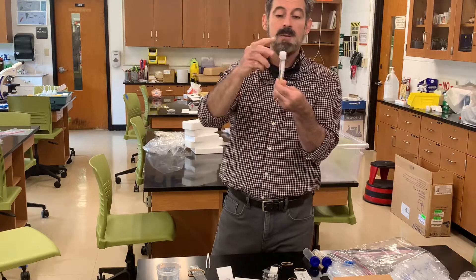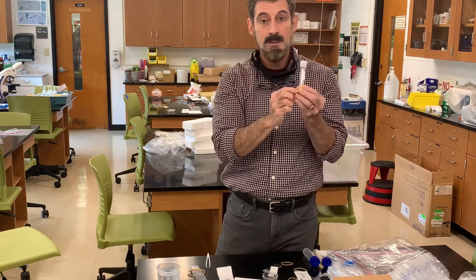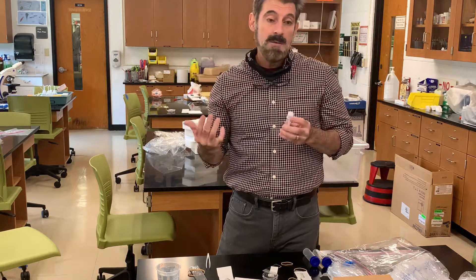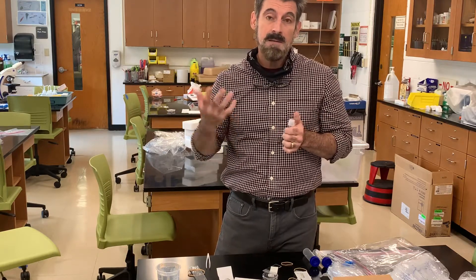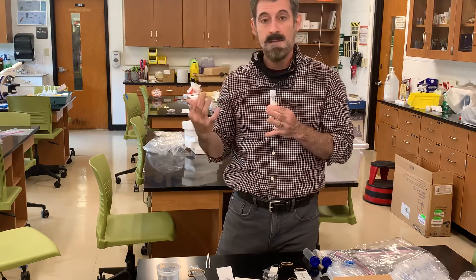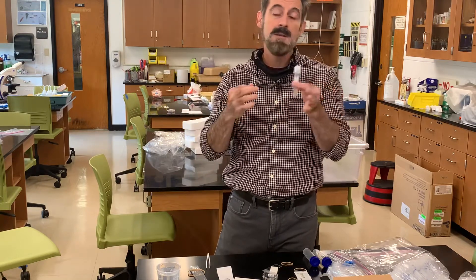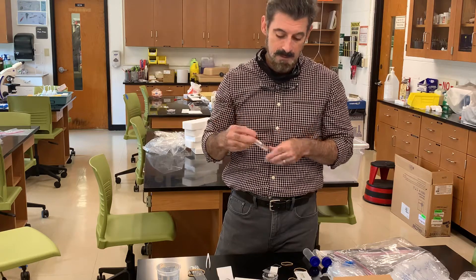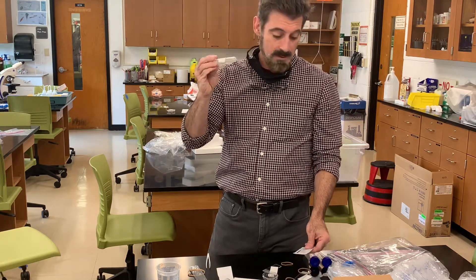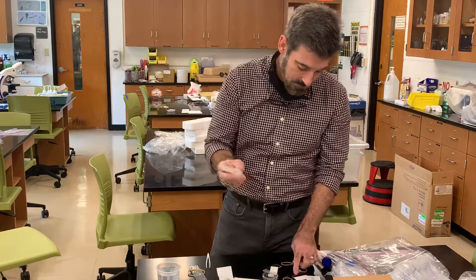In another small tube you're going to have pH strips. There will be a pH lab where you collect different liquids from around your house — anything from juice to water and other things — and measure their pH. There will be a reference to a pH scale, and you'll use the pH test strips to test each liquid.